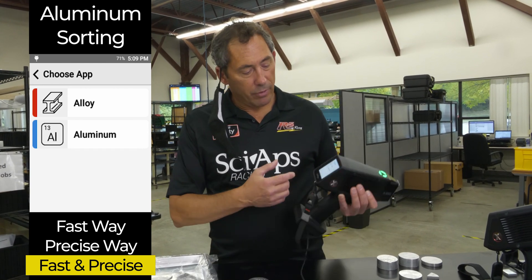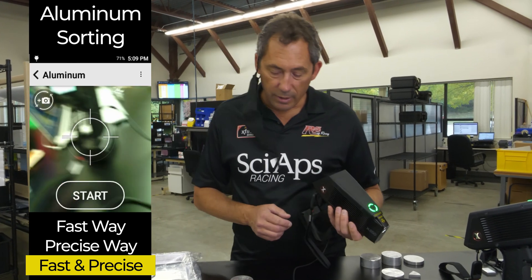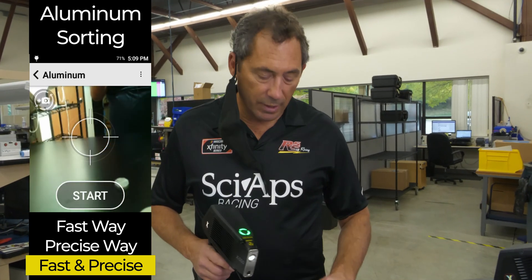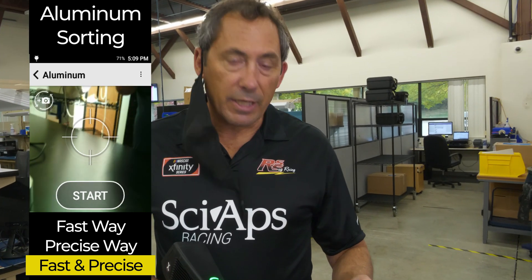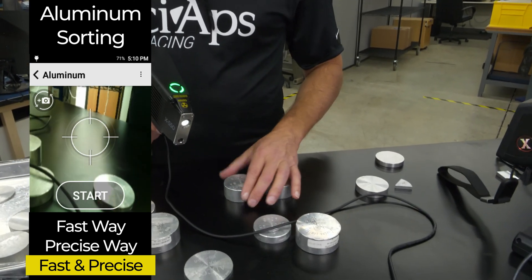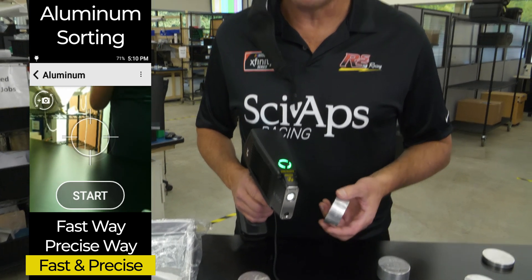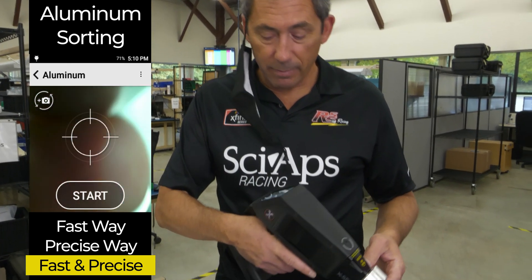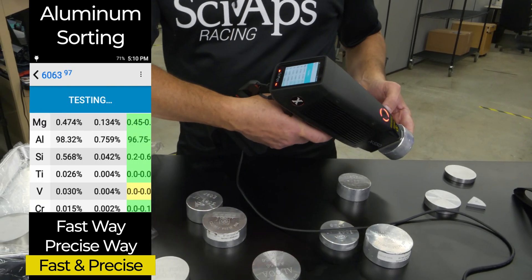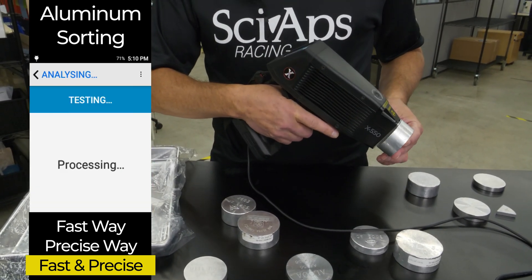So with the aluminum app, you can bring up your home screen — it's an Android-based system. You tap on aluminum and you're ready to go. We talked earlier about sorting our favorite example: 1100 and 6063. That's a fairly common mix-up because they both have low copper, and 6063 has some magnesium while 1100 doesn't. The old guns might have taken a minute to see that magnesium, but with our aluminum app it's about a two-second test. You pull the trigger, a couple of seconds — 6063, there's your magnesium.